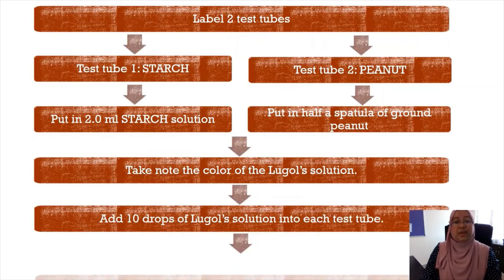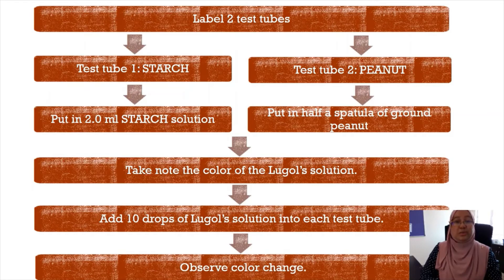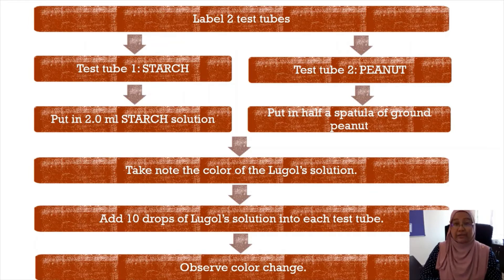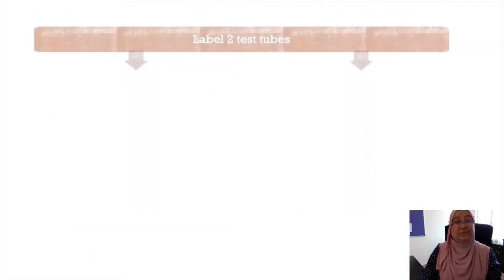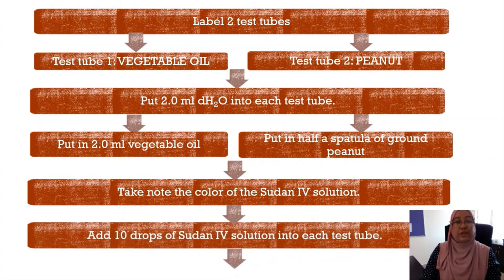This procedure is carried out to determine the presence of polysaccharide. Label two test tubes: test tube one for starch, test tube two for peanut. In test tube one, put in 2 ml of starch solution. In test tube two, put in half a spatula of ground peanut. Take note of the color of the Lugol's solution, then add 10 drops of Lugol's solution into each test tube and observe any color changes.